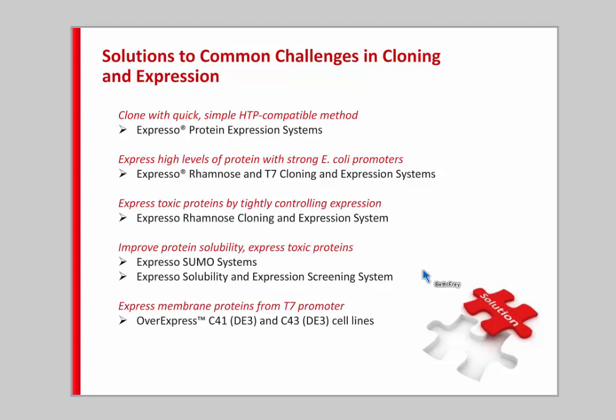We'll start by talking about how to clone faster in a method that is truly high throughput compatible. We'll talk about how to express high levels of proteins and how to control that protein expression level, as well as how to improve protein solubility.